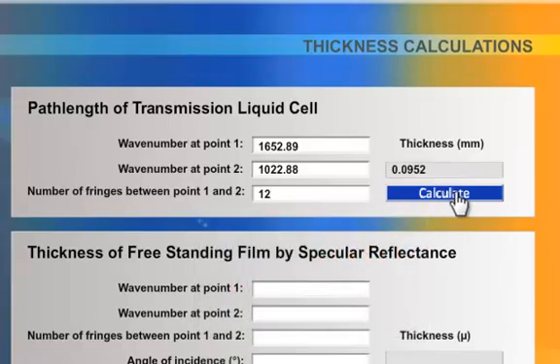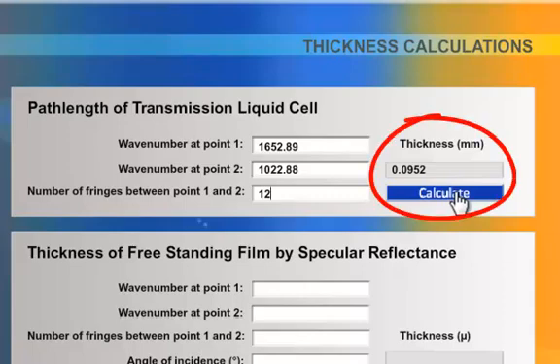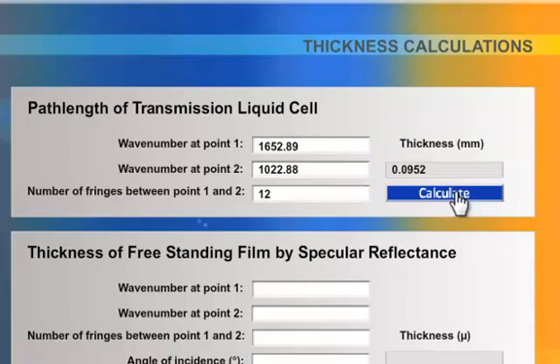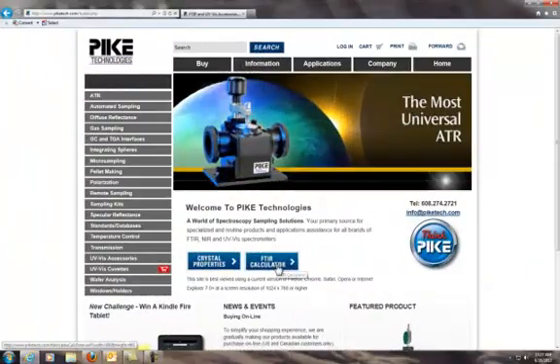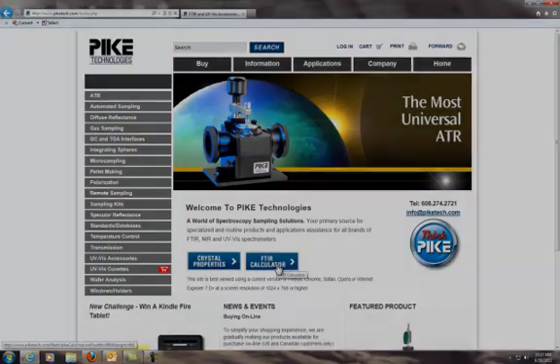Press calculate, and voila! The answer is 0.095 millimeters. Be sure to check back at piketech.com and test your skills in future challenges.